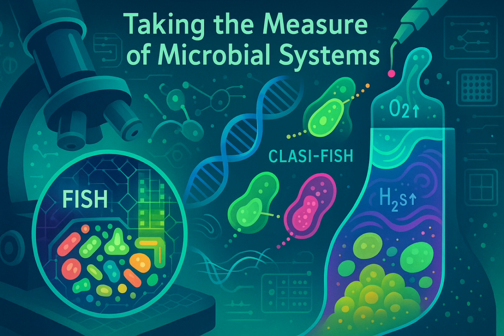Okay, so culturing is powerful for digging deep into one organism, but we know it misses a huge chunk of the community. So how do we study microbes in their environment without the culture step? Right, this is where the culture-independent revolution happened. And believe it or not, the microscope is still a cornerstone, just a much more sophisticated microscope now.